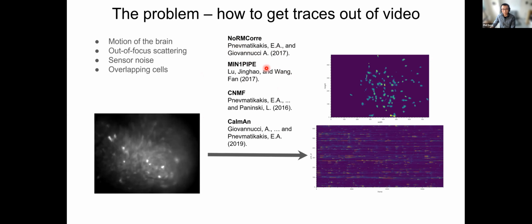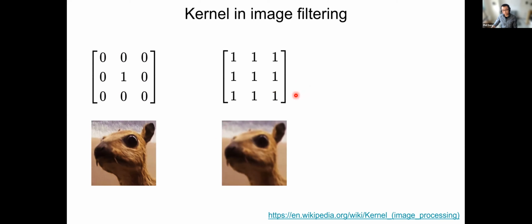Here is an example 3x3 mean filter kernel. The effect of this is that for each pixel, you take the mean value of this 3x3 window of the surrounding pixels, because all of these numbers are 1 here and all the pixels contribute equally in this kernel. And the visual effect of this is that you have a blurred image because, for each pixel, you're kind of averaging across its neighbors.